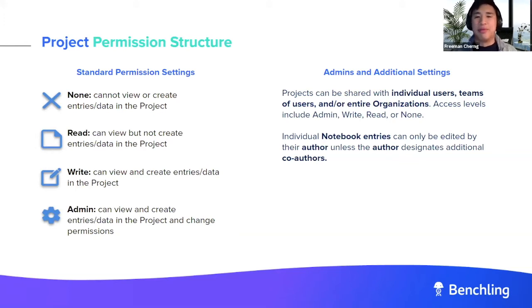And just as an example for why all of this is important, we see many use cases where we have external collaborators, such as CROs, temporarily needing access to very particular sets of data. So for these cases, you can generate a project just for them, in which the data that goes into that project is carefully selected and reviewed. So of course, this type of data management and organization is also used internally by giving write access to particular teams and read access to teams that might not or should not contribute data to particular projects.